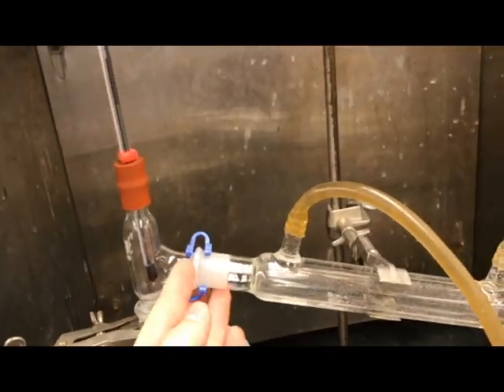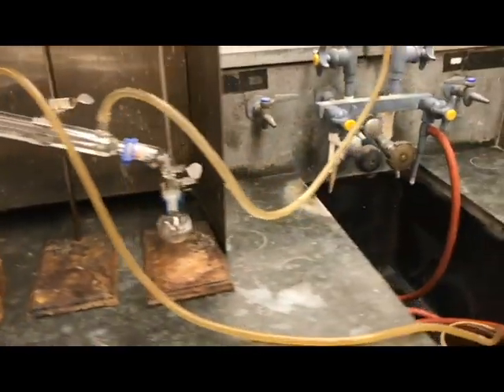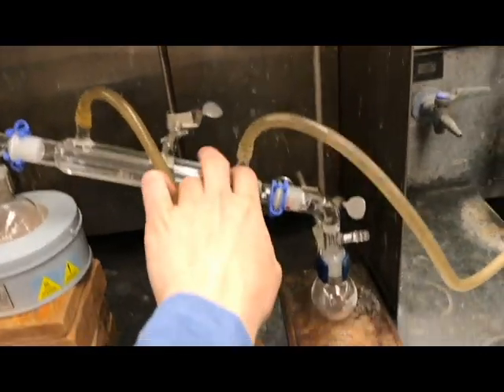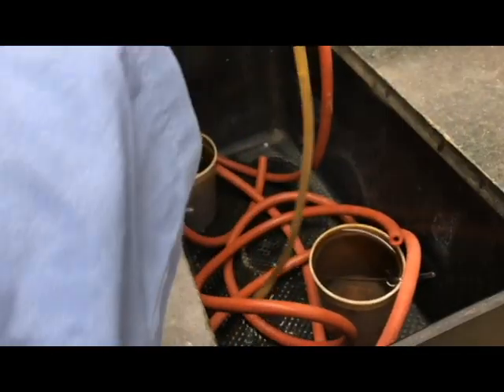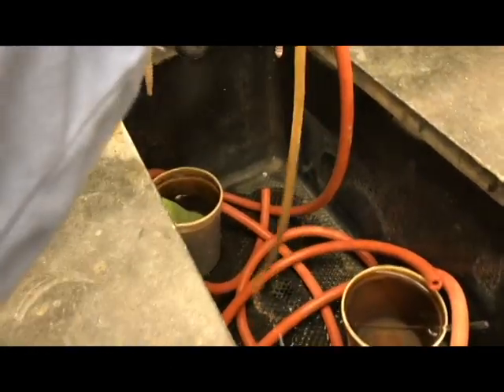Off your three-way adapter, we have a condenser. Again, same idea as what you used before in previous labs. We have the water coming from the faucet going into the bottom adapter right here. Water feeds in, comes up through, leaves the top, and then goes back into the sink. You only need a small trickle of water just to keep your condenser cold.